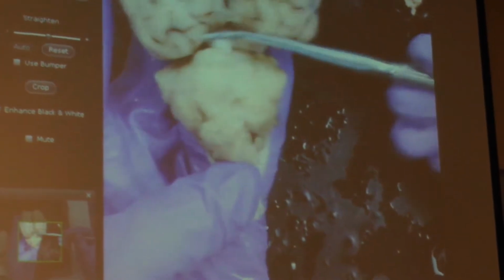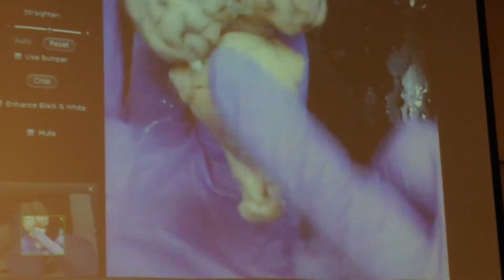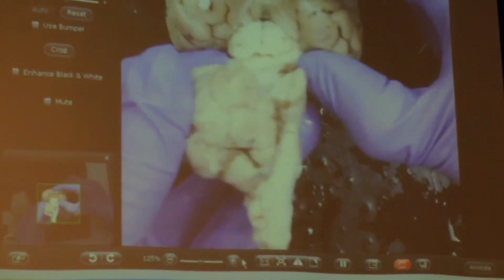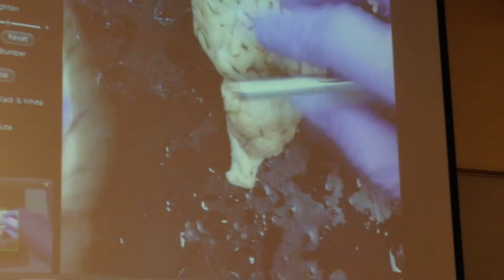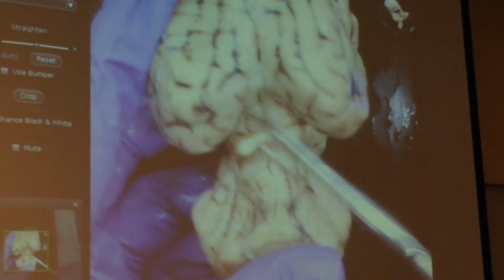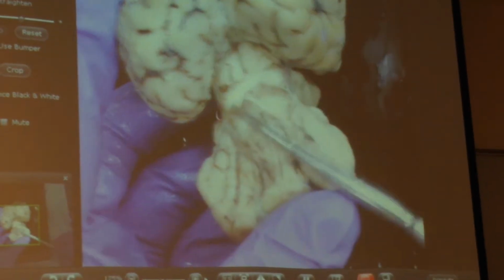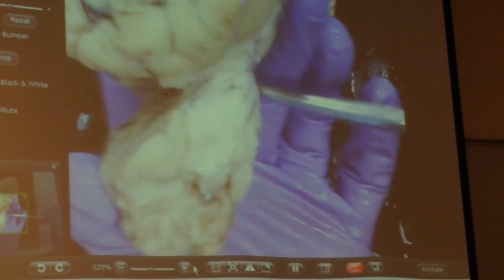Then, if I look right here where the, what was this fissure again? Transverse fissure. If I pull the cerebellum down, can you all see right here these 4 bumps? These 2 on the top, these 2 on the bottom, not that great. Let me see if I can see it better on this one. There we go, a little bit better on this one. Can you see that 1, 2, 3, 4? What are the 2 top ones? Superior colliculi. And what are these 2 bottom ones? Inferior colliculi. So this must be what part of the brain?